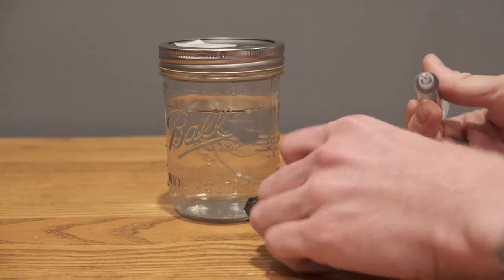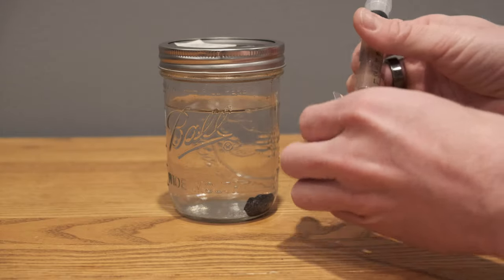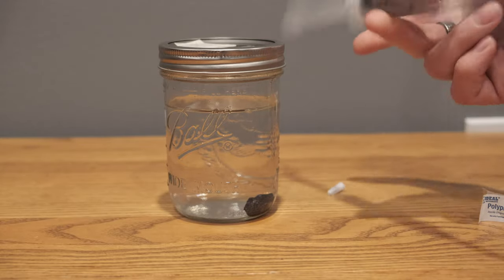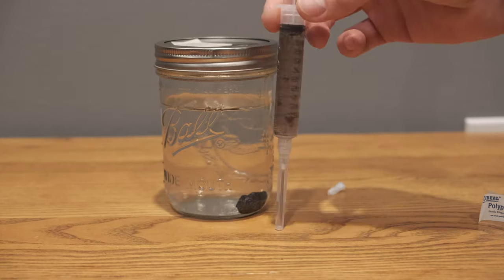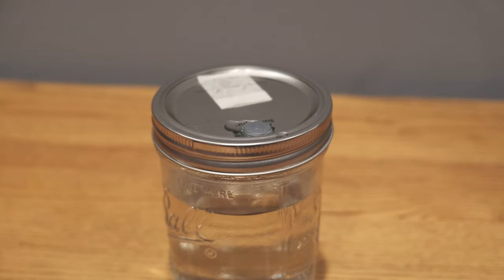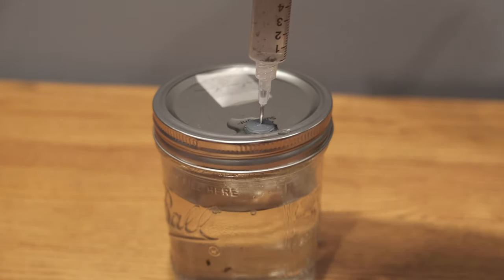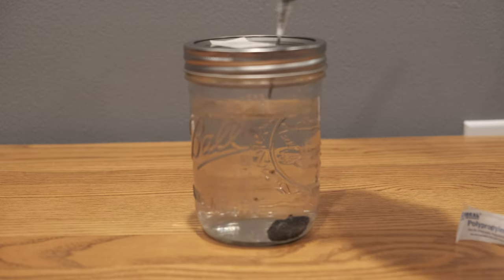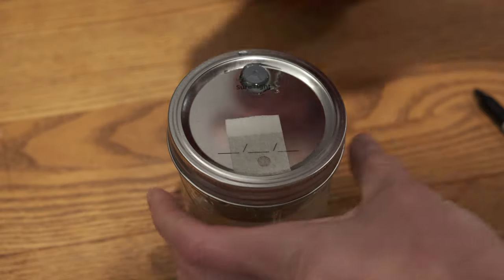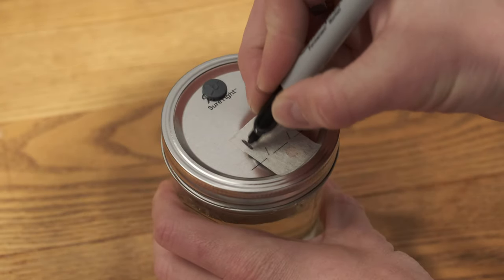I prep this by opening the needle, pulling the cap off the end of my spore syringe, and then giving it a really good shake. I add a few drops of isopropyl alcohol to the injection port and then send it. Give the syringe a quick flush, and then I label it with my own proprietary labeling system — just joking, it's not proprietary.